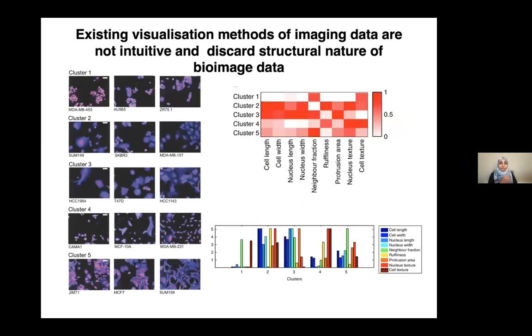Going back to one of the challenges I'm working on, in addition to overlaying information on top of images, one of the things I find very challenging is that we are able to generate hundreds and hundreds, or even thousands and thousands, of images very easily. Summarizing this data in an intuitive way that helps us understand the biology is still a major challenge.